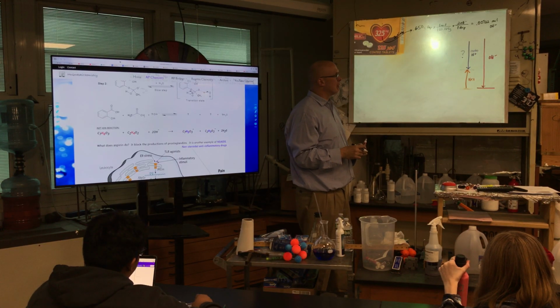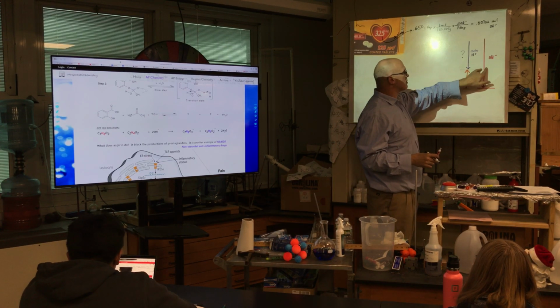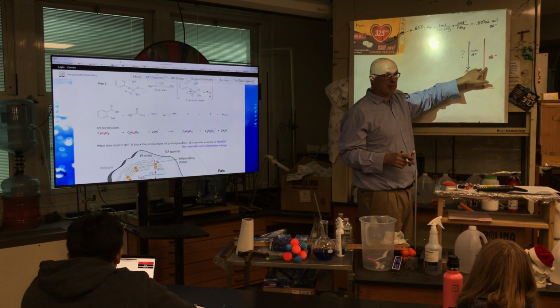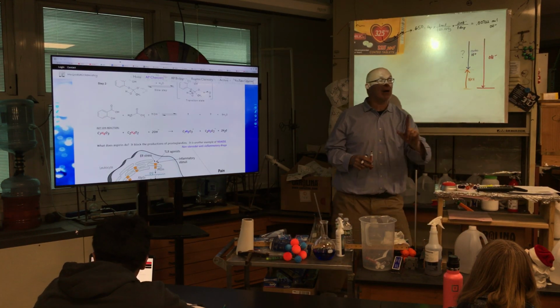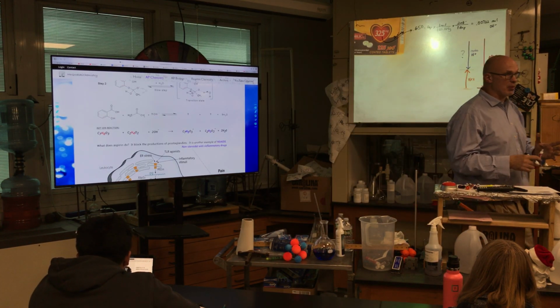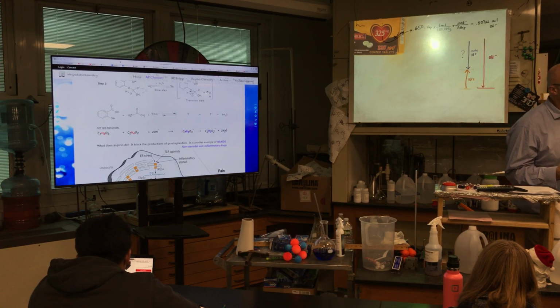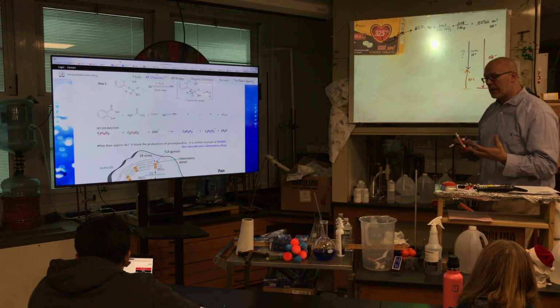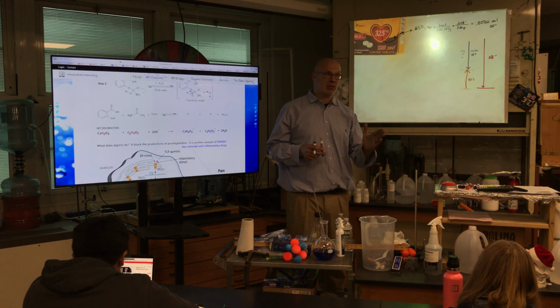Okay. So yesterday I drew an arrow down first. I think that's my confusion with some of my first period class. That would be exactly the moles of hydroxide needed to neutralize the aspirin if the tablets were 325. We don't know. This is a quality control test. We don't know if they're under, above, or at that, so we can't just stop there.